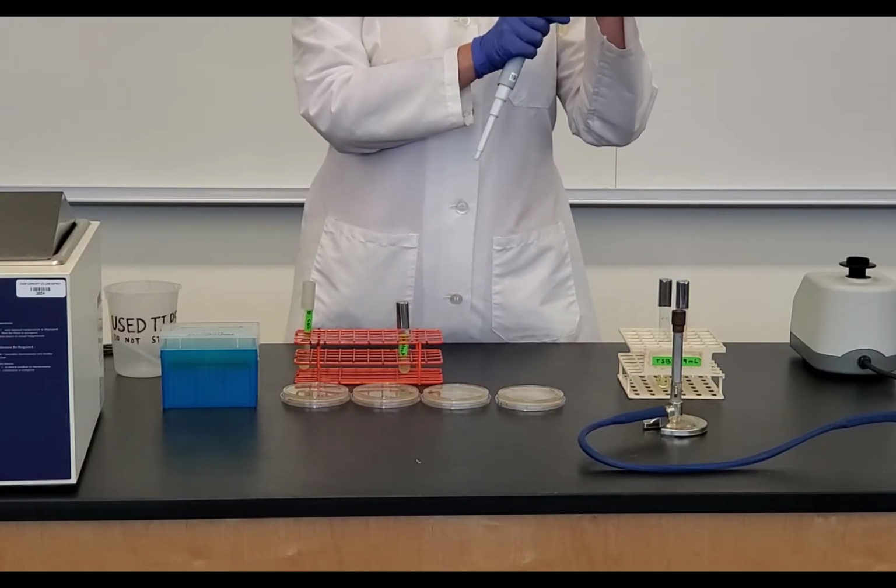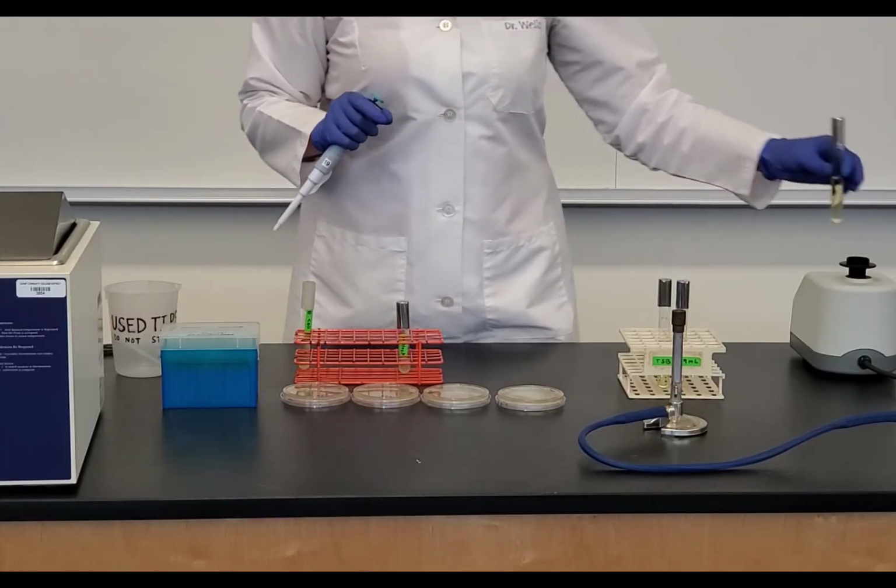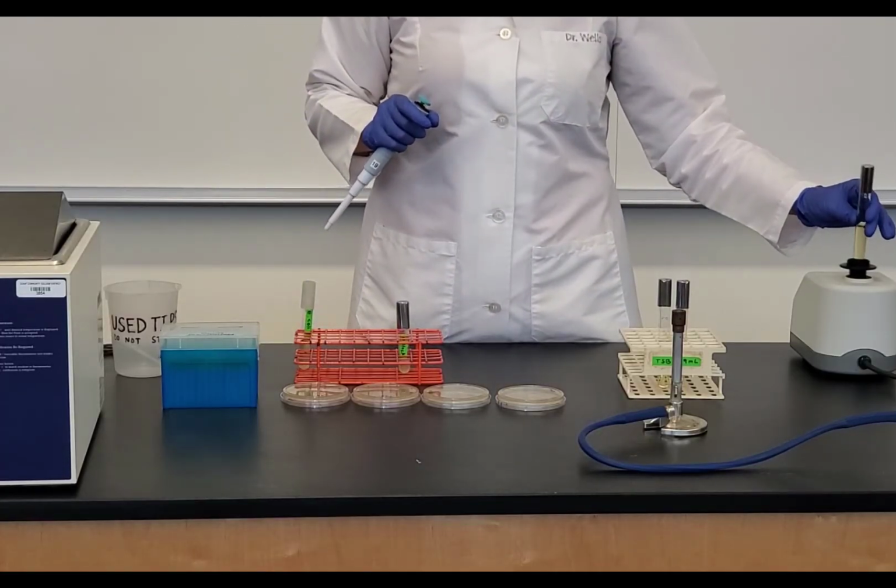Before I transfer from this tube to my 10 to the negative 4, I need to vortex. So I'm going to vortex to mix well, so that way my virus is completely suspended.